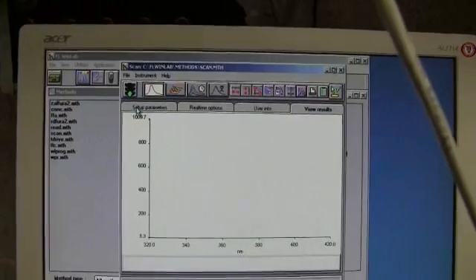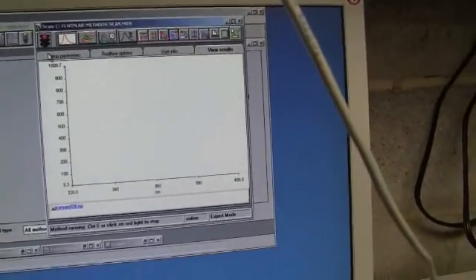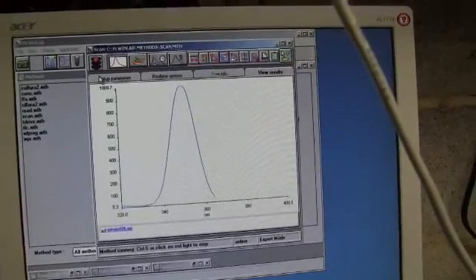Running a short scan on distilled water. At 300, we're exciting it at 350 nanometers. Nice peak.